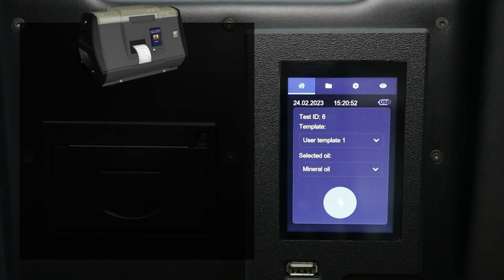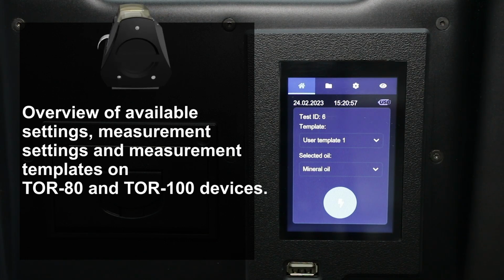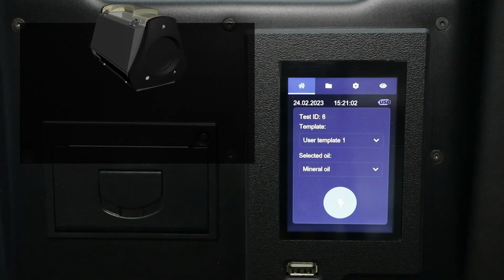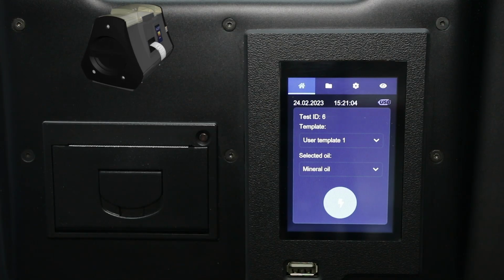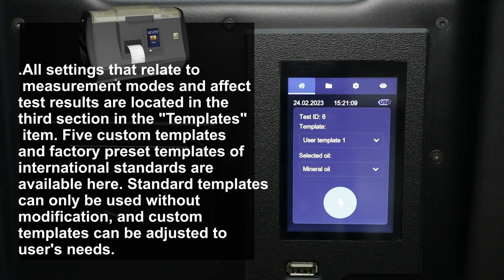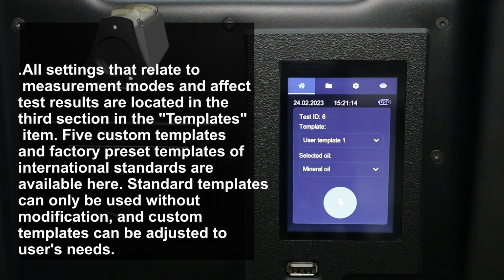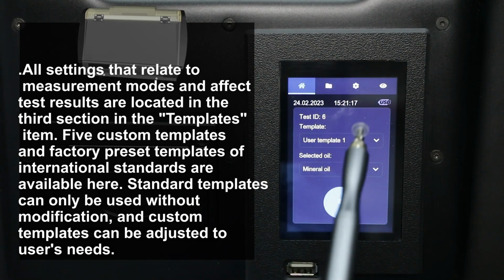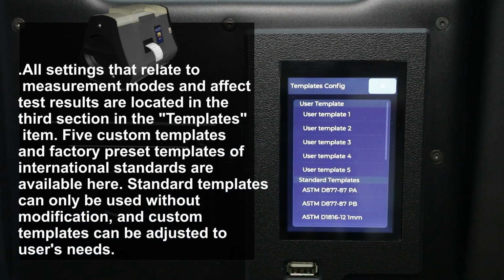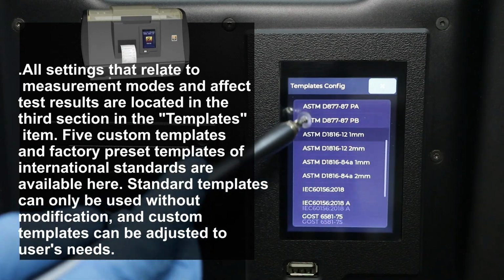Overview of available settings. Measurement settings and measurement templates on TOR-80 and TOR-100 devices. All settings that relate to measurement modes and affect test results are located in the third section in the Templates item. Five custom templates and factory preset templates of international standards are available here.